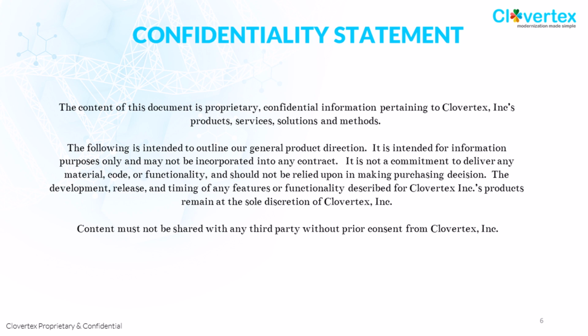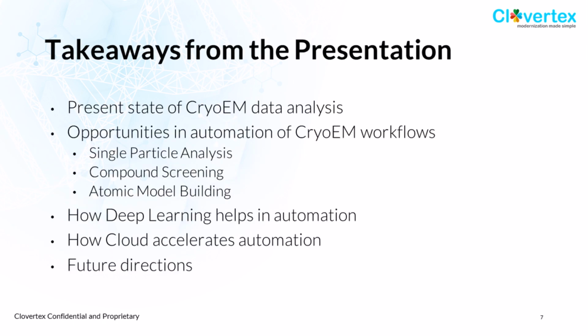What we are going to cover today is really to talk about the present state of cryo-EM data analysis. What are the opportunities of automation in the cryo-EM workflow for data analysis? We will touch upon single particle analysis, compound screening, some of the atomic model building, how deep learning helps in automation, and how cloud accelerates this automation. So without further ado, we'll start with introductions.